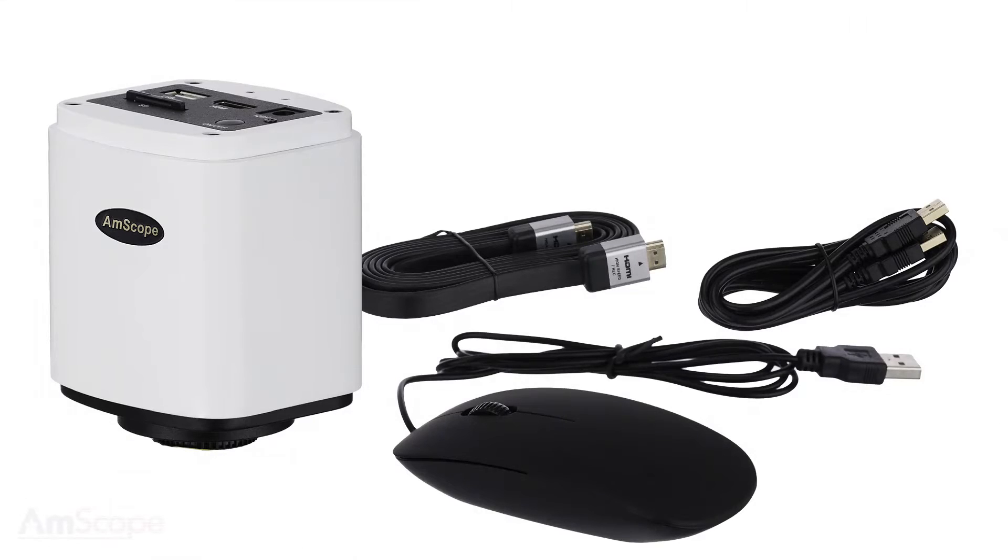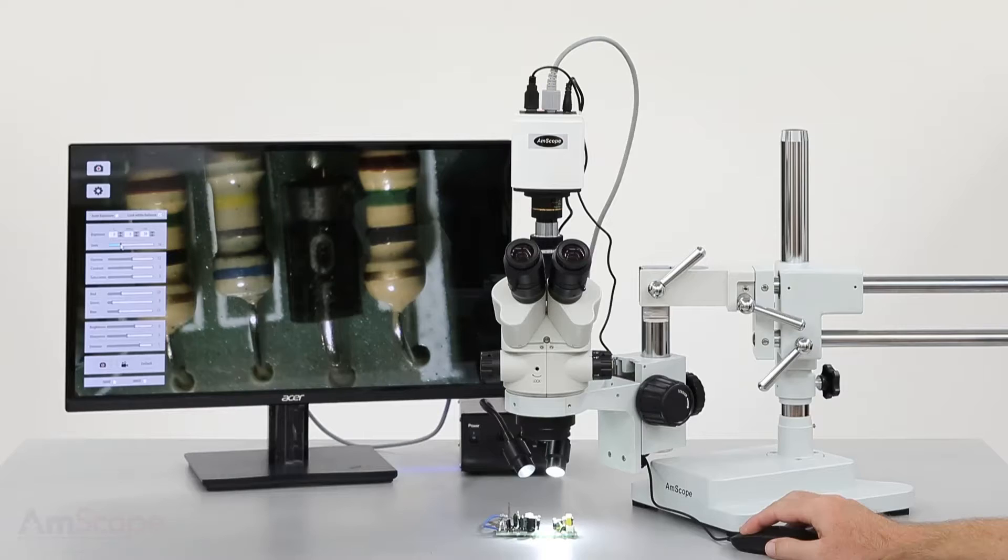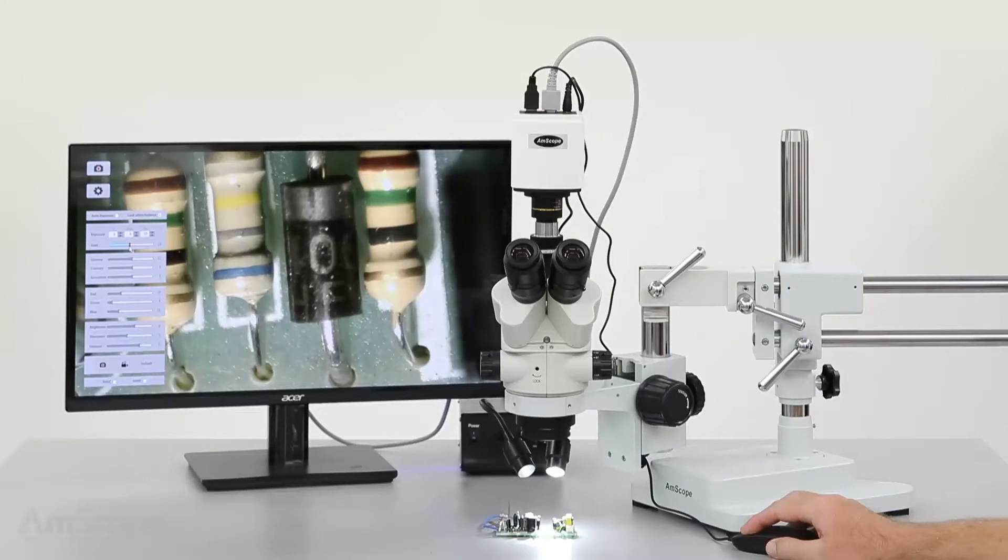This video will give a brief explanation on how to set up and use the HD 1080 camera. The HD 1080 can be used as a standalone imaging system or connected to a computer. This video will focus on using it in standalone mode.